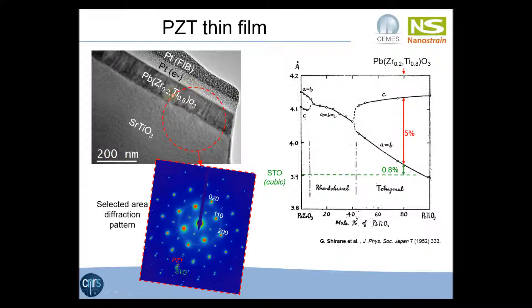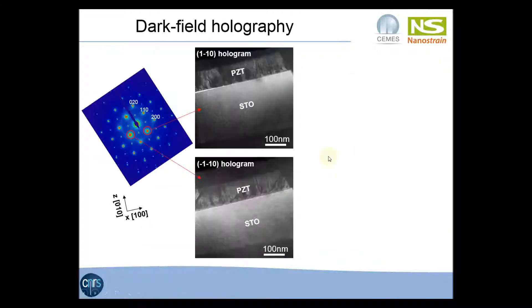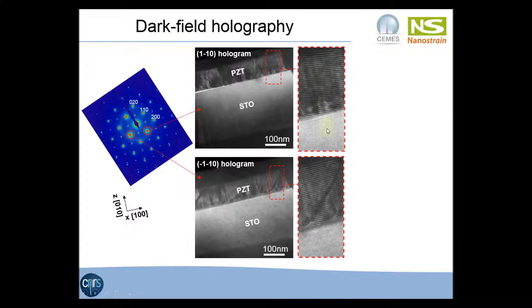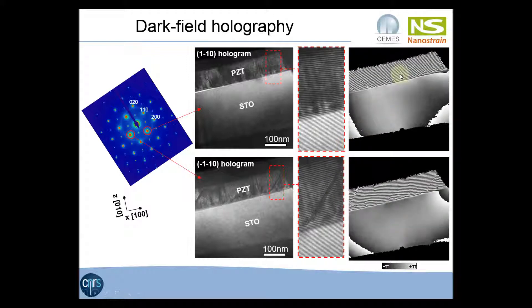A selected area diffraction pattern of this region shows that the spots are split along the growth direction, meaning the C parameter is mainly in the growth direction — so the main domains should be C domains. These are two dark-field electron holograms obtained using 110 diffracted spots, which are more intense and give better contrast. The fringe spacing is larger in the PZT layer compared to the STO substrate because the PZT lattice parameter is larger. There is also a rupture of the fringes due to a small A domain. These are the phase maps reconstructed by Fourier processing, which contain a lot of structural information.